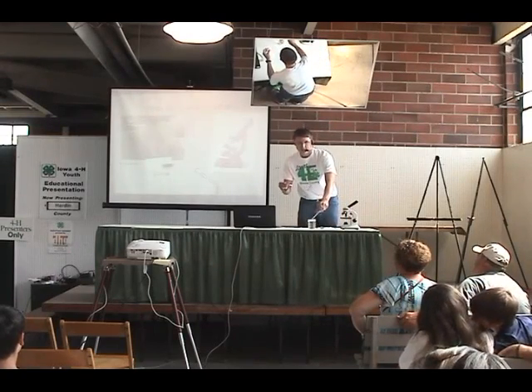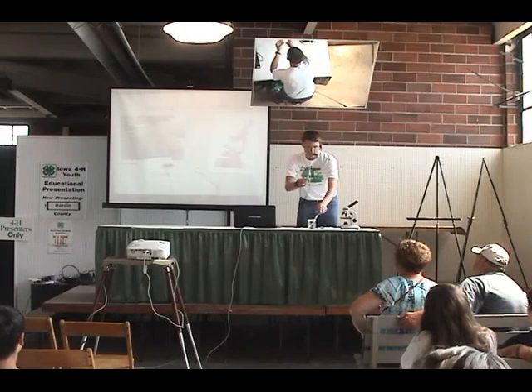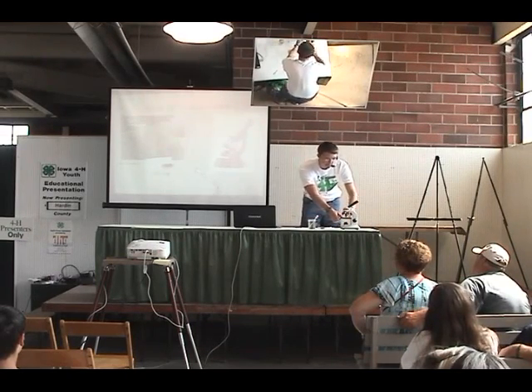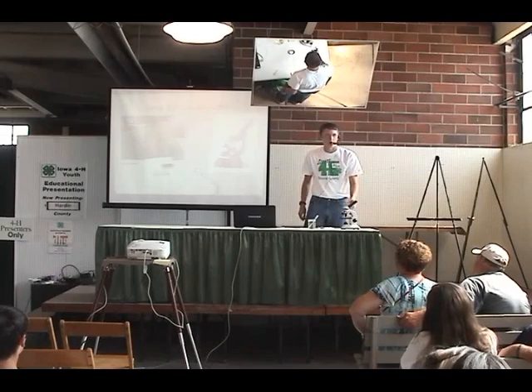You'll just take your eyedropper and put a few drops on the slide, like this. And then you'll put it on this part of the microscope, which is called the stage. And you'll slide the sample over the hole where light passes through. And then it's also important to make sure you turn on your microscope.